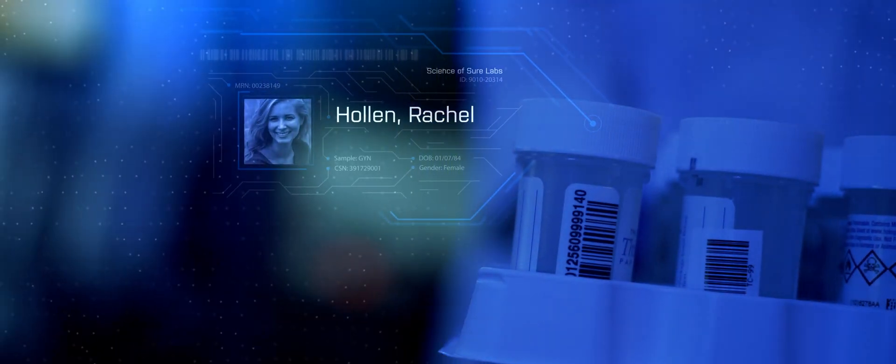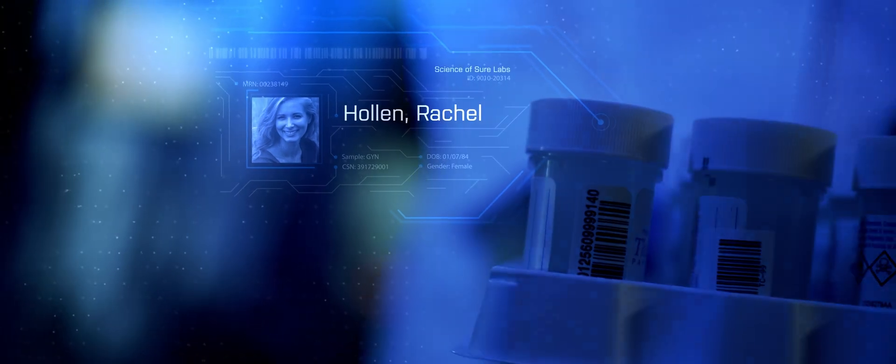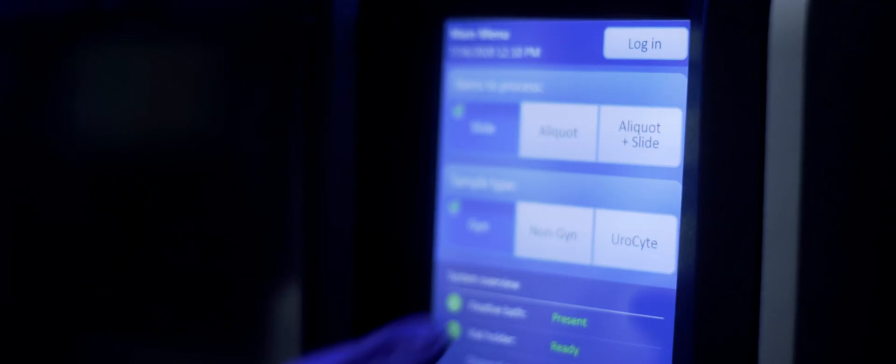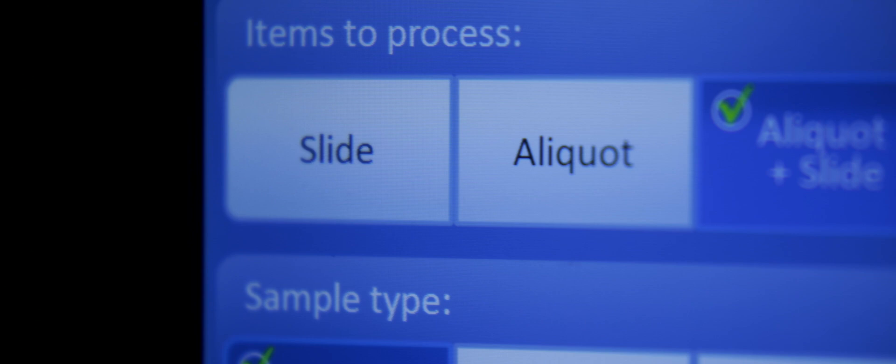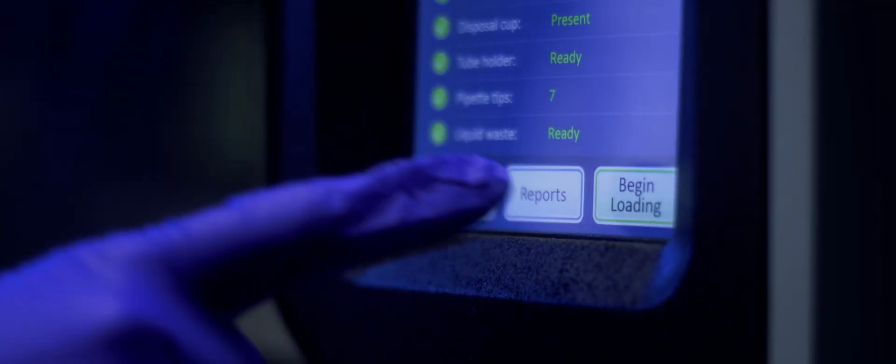In today's busy labs, a seamless, reliable, and simple workflow is critical because every sample represents a patient requiring careful handling and accurate identification. Labs everywhere need to be confident in results without compromising productivity.